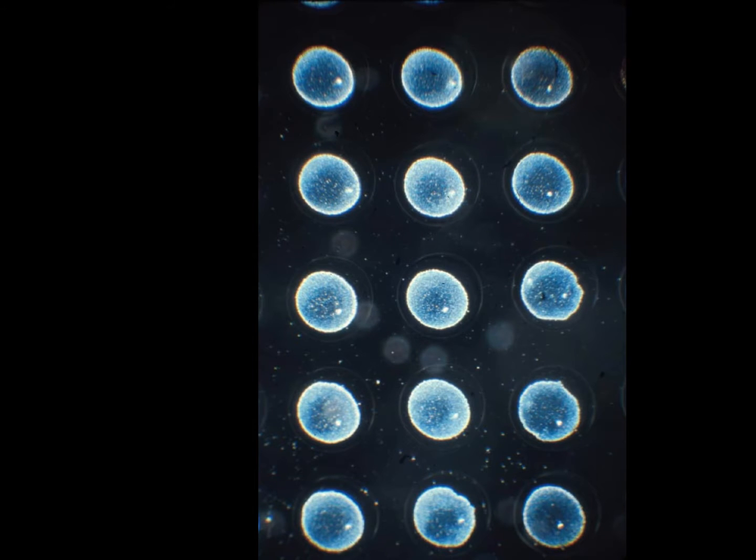Bill Bonner had earlier made the first sorter, which was based upon fluorescence. So individual cells could be sorted in individual droplets, and this is a slide of Dick Stovall having deposited individual beads, I think, rather than cells. And this cloner, as we called it, which could clone individual cells by FACS, was developed by Dave Parks.